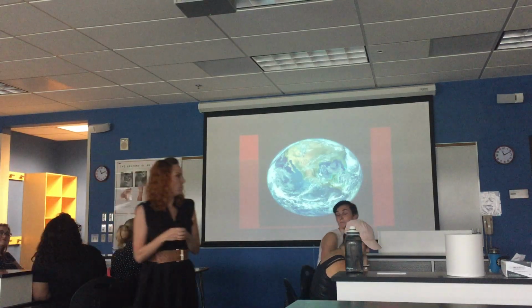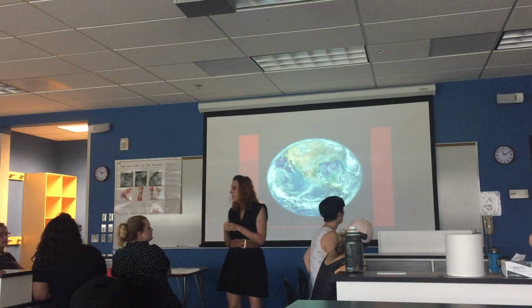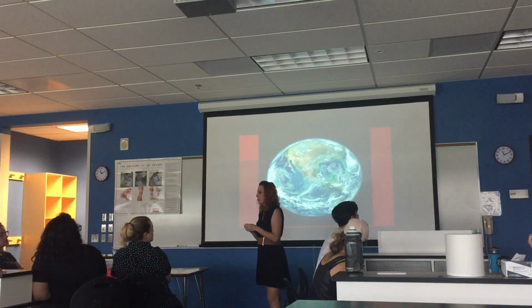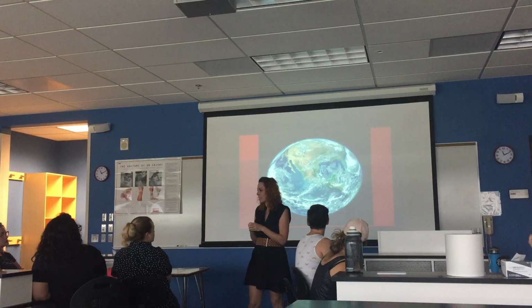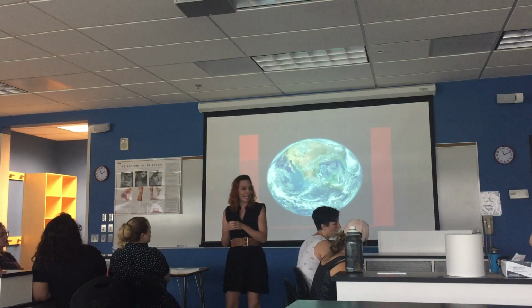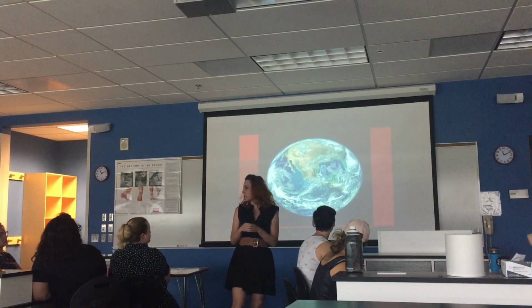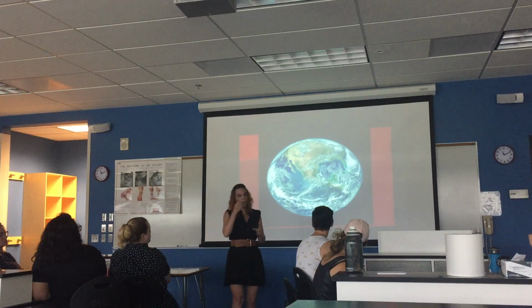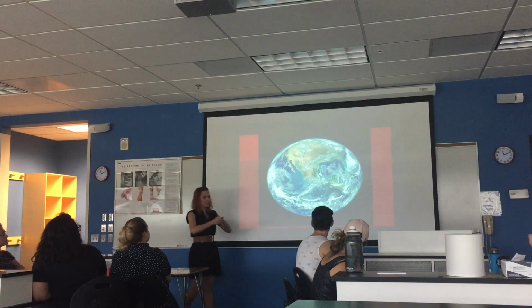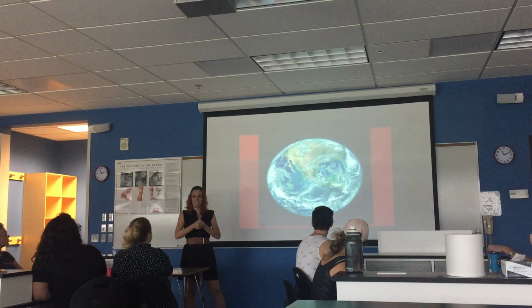Cool. But you know, right, that if you're standing in, I don't know, the desert, it's going to be hard to find a tree in the forest. Or if you're out on a kayak in the ocean, okay, it's going to be hard to find a tree in the forest. Okay, so this is the way that I would like you to use the scope, is to think of 4x as kind of like being on the space station.